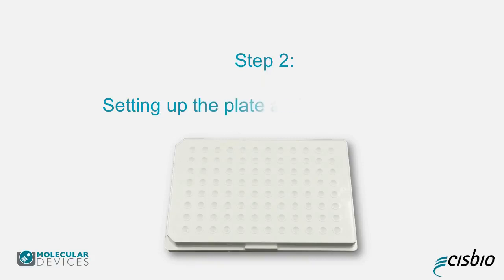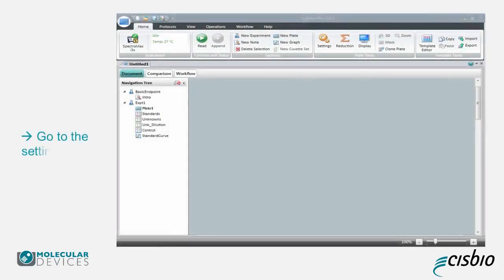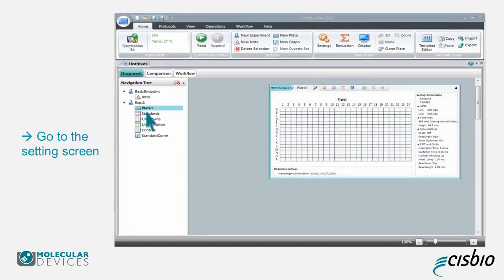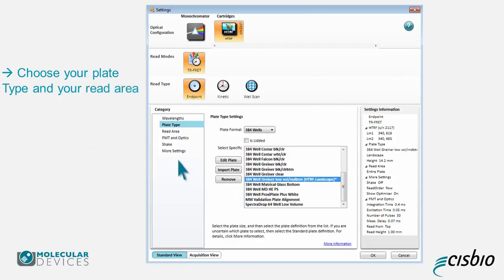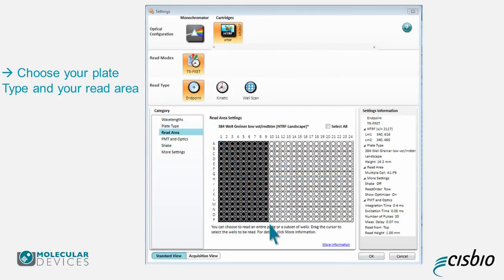Step 2: Setting up the Plate and Data Reduction. Once you have selected your protocol, click the Plate 1 icon and then click on the Settings button. Choose your plate type and your read area. Be careful here as it only manages right-angled areas.